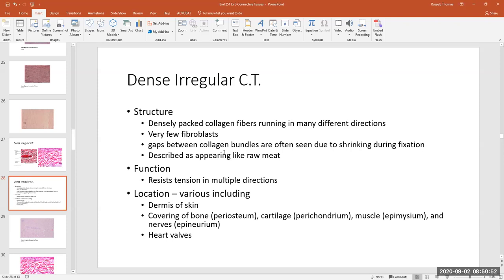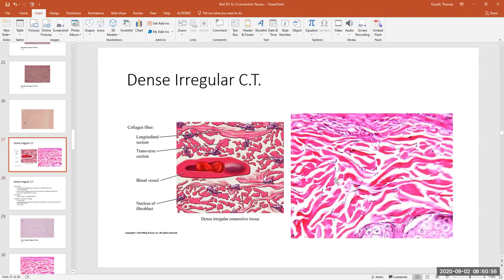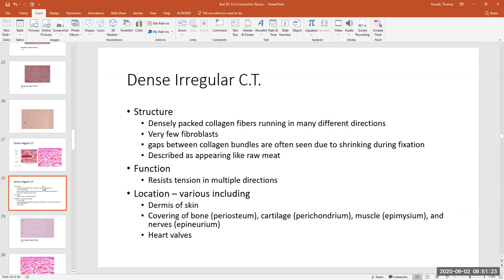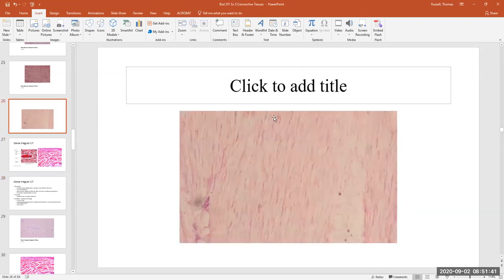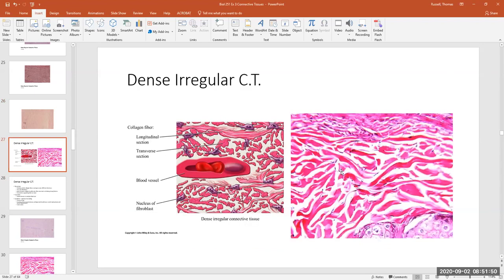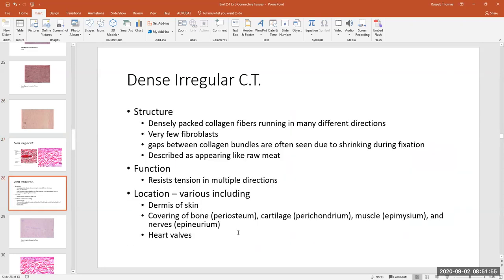The gaps between the collagen bundles where you see space are an artifact of fixation — when we fix the slide it causes the collagen fibers running at different patterns to pull apart from each other. In the living organism there's no real space; the collagen fibers are still packed together, just running in different directions. Since those fibers run in all directions, the tissue is very good at resisting tension in multiple directions.